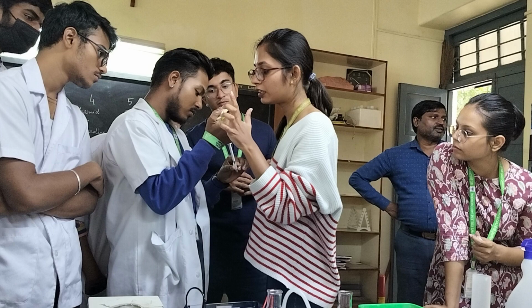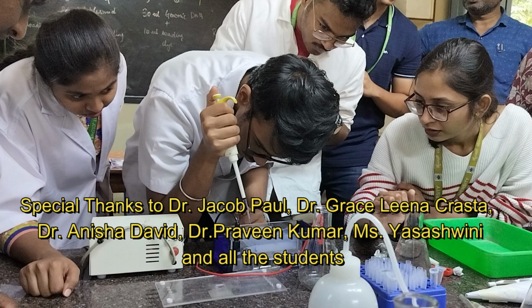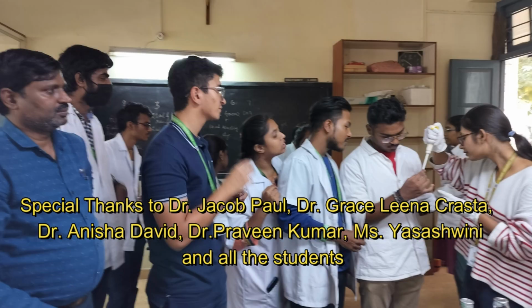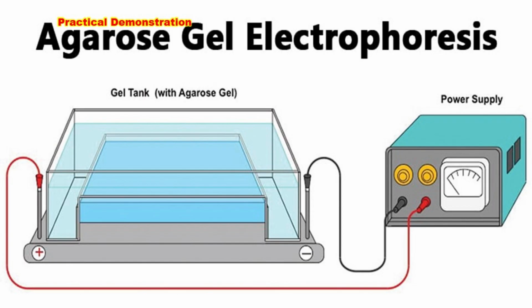There are 2 precautions that you must consider. Number 1 is ethidium bromide must be handled carefully. You must wear gloves when you are using ethidium bromide, because it's a mutagen and a carcinogen. And the next important precaution is ensure that the gel is oriented in such a way that the wells are placed near the cathode and away from the anode. As DNA moves towards anode, the red terminal is anode and the black terminal is cathode.